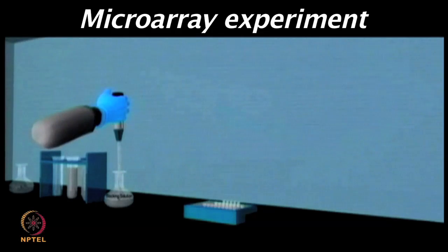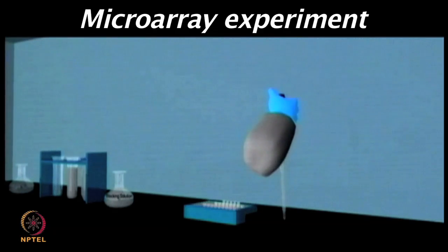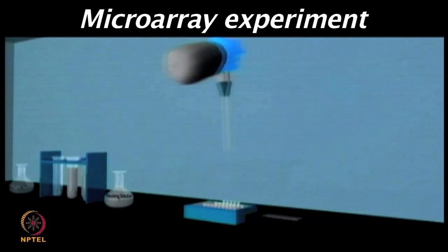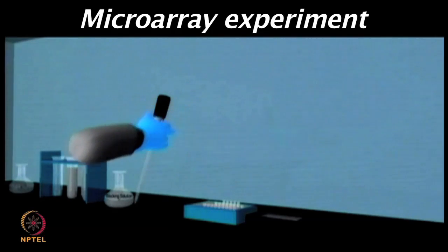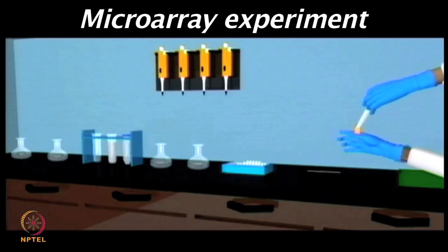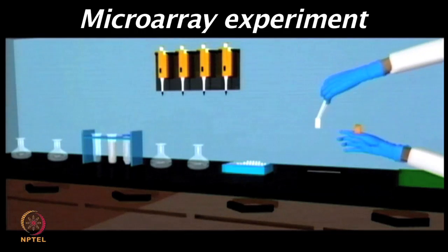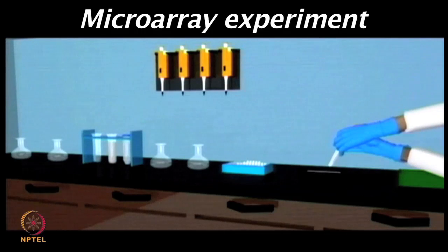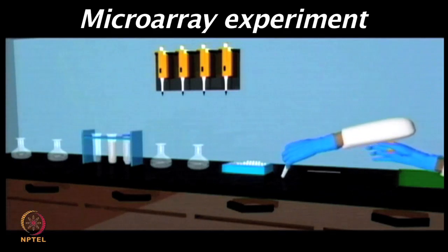Blocking can be performed by using milk, it can be performed by using BSA, super block, and some scientists prefer a cocktail of different reagents which could be used for the blocking solution. Typically, blocking can be performed at room temperature for an hour on a rocking shaker, or it can be performed at 4 degrees overnight in cold conditions.